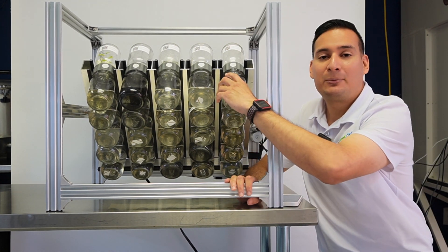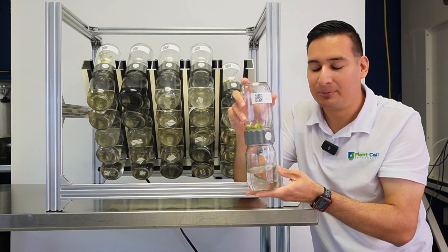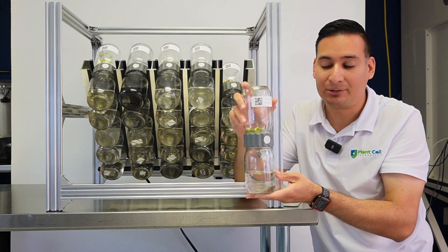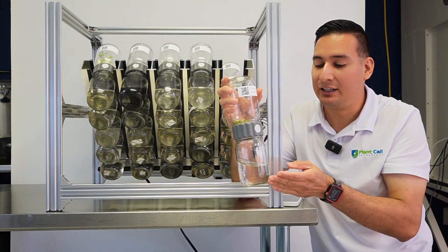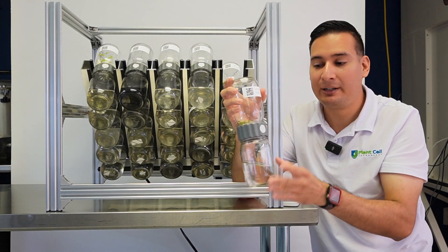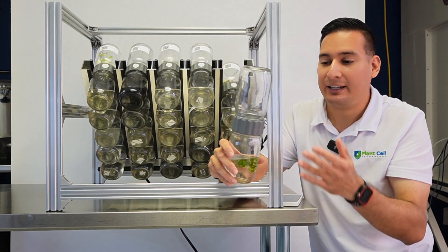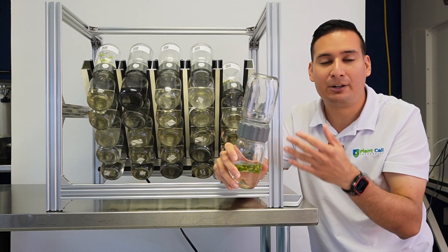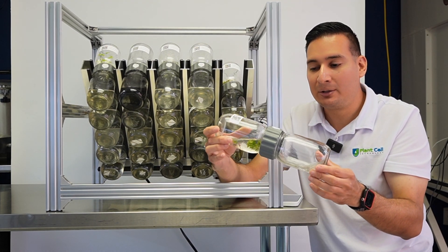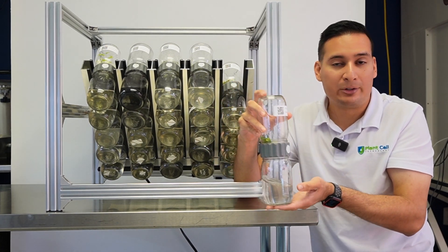For over a year we have had hundreds of people testing the BioCoupler, which is our temporary immersion bioreactor system from Plant Cell Technology. This is a very simple system that requires only two jars and a coupler, and you flip it once or twice a day. It works great — you can grow thousands of plants super fast.